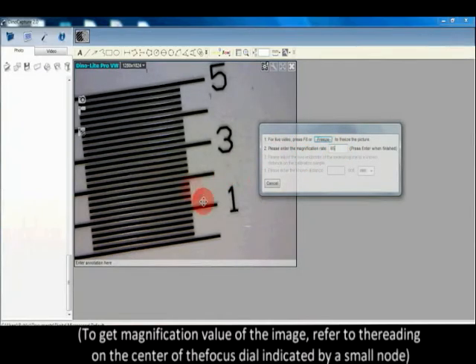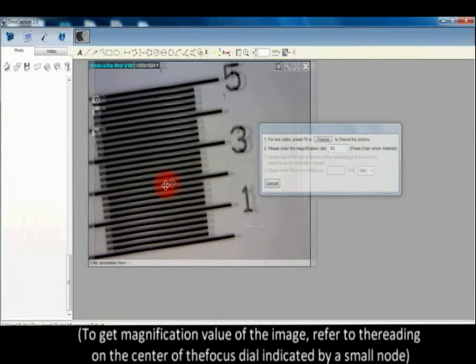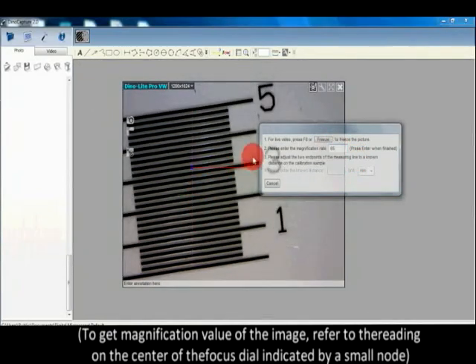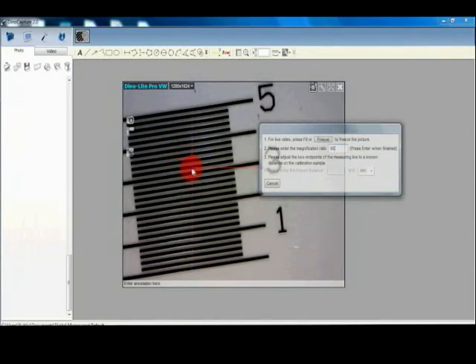To get the magnification value of the image, refer to the reading on the center of the focus dial indicated by a small node.